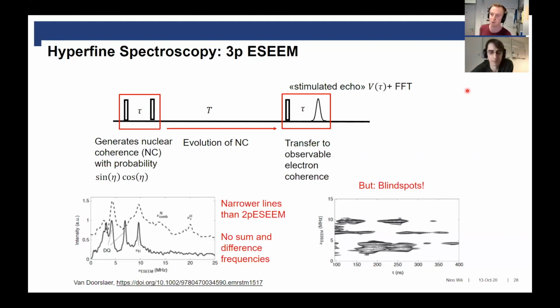It's not very widespread, but some obvious applications that you know from NMR are broadband inversion pulses, where you can use chirp pulses to invert, or Gaussian pulses to be more selective or have a nice selectivity, things like this. So I would say it's coming up, but it's not normal yet. Let's put it like this. I mean, there are AWGs in the modern Bruker machines, but I haven't seen them used that much yet. Okay, so watch this space.